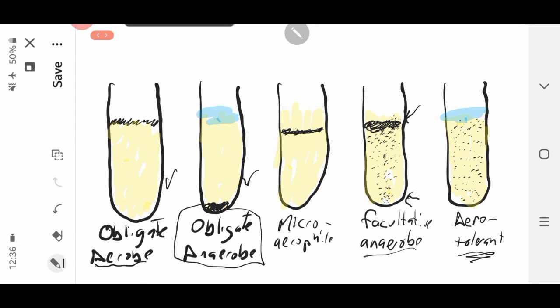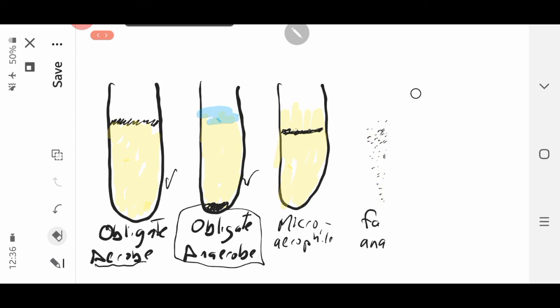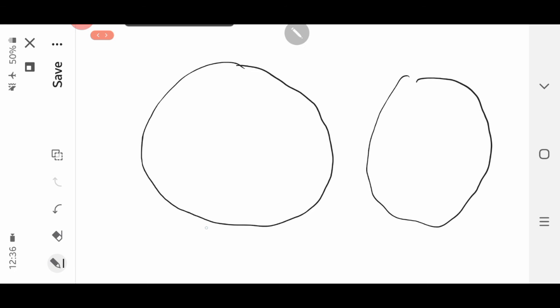We also did plates. I don't know if there might be a better way to do this, but we're just going to erase. We also did plates, and the plates we grew in the presence of, plates with no oxygen present. Well, where are the ones that we grew with oxygen? Well, if you remember, we did our unknowns, and those have been in the refrigerator for a while because we did colonies with those a long time ago. We did streak plates with them. So you have your 2 plates.